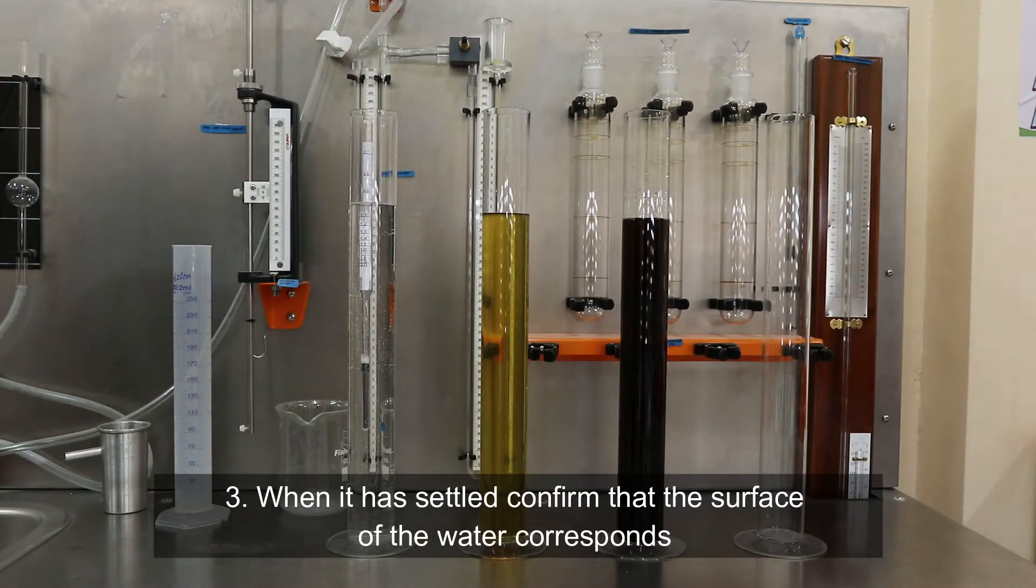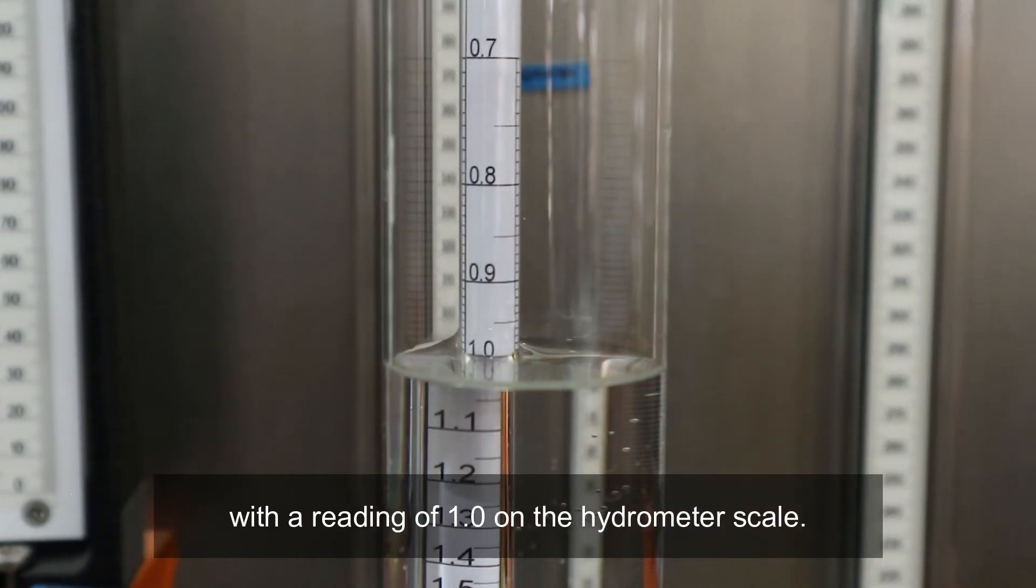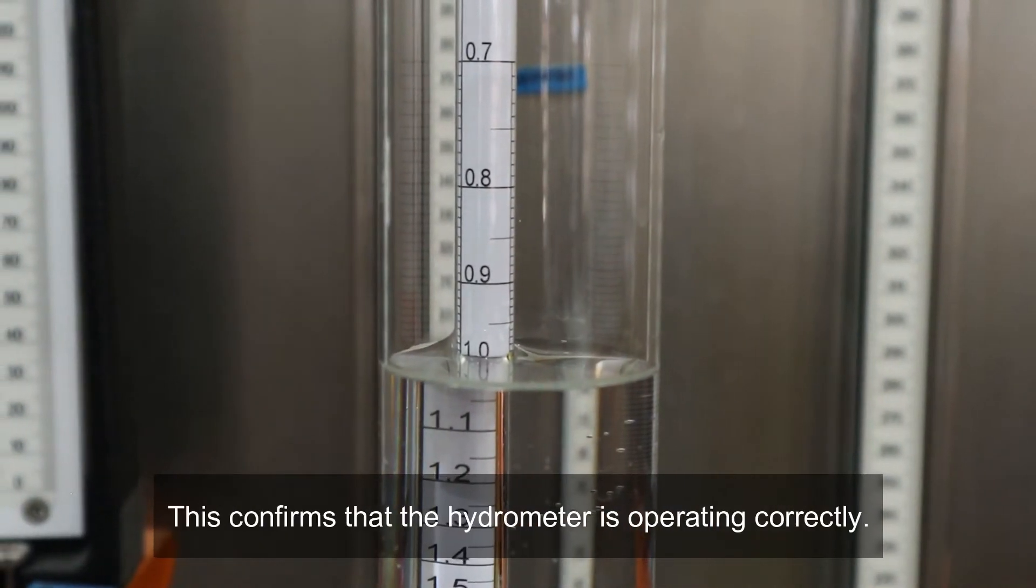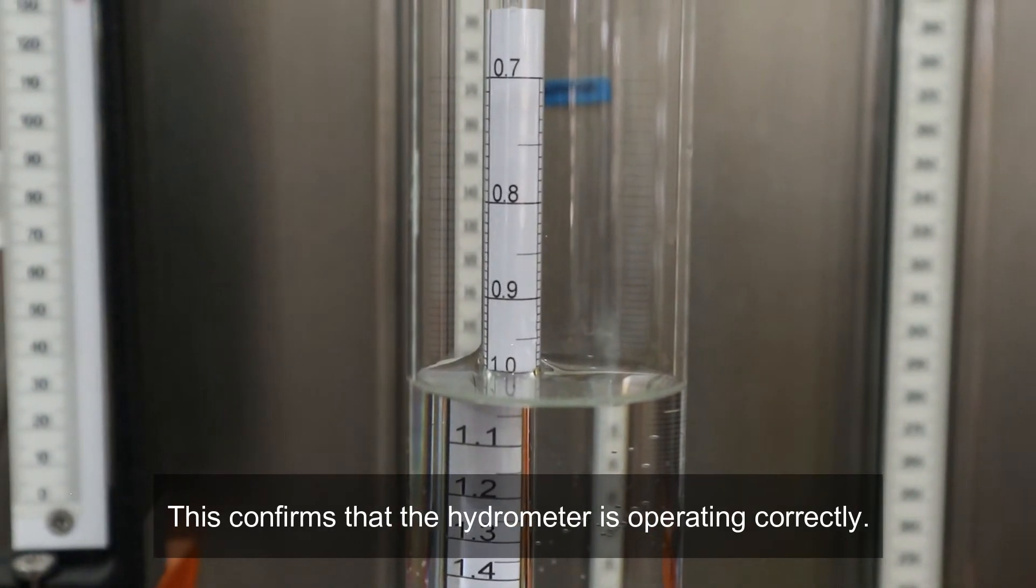Third, when it has settled, confirm that the surface of the water corresponds with a reading of 1.0 on the hydrometer scale. This confirms that the hydrometer is operating correctly.